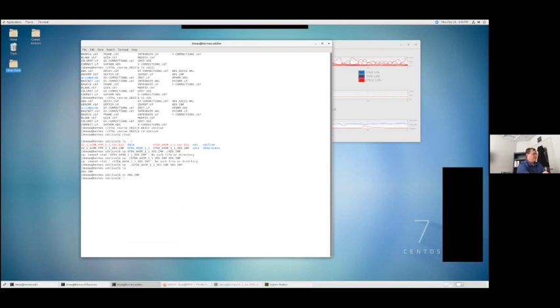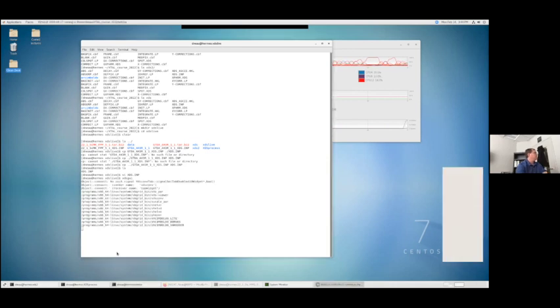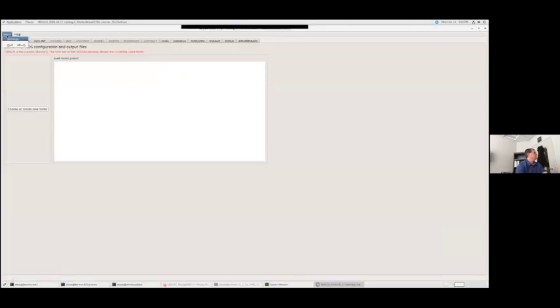To give you a better idea of what we're doing, I'm going to run XDS GUI and show you how to run from there. Before I do that, you can run XDS GUI if you have an input file already in the directory. It will read that. For this case, I'm going to actually remove that so we can see how to run it from the get-go.